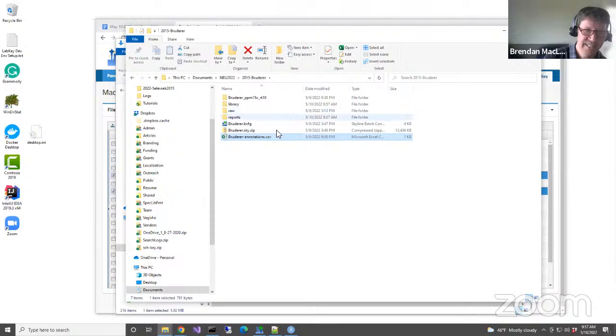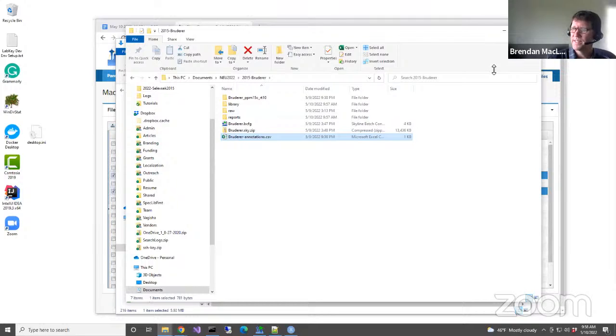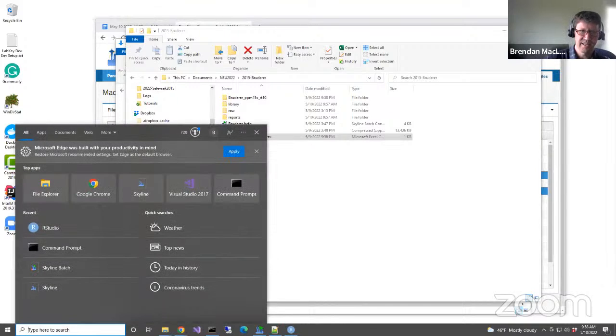Okay, but now let's go ahead and, wow, my video keeps stopping. I get frozen. So now let's go ahead and start doing the steps to create a template. So to do that, we're going to start Skyline.